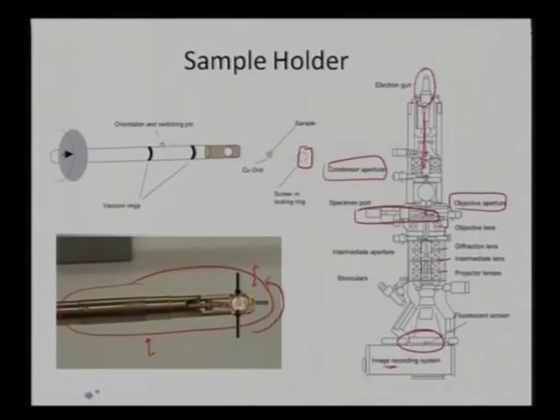But preparing a sample to attain transparency to electrons is very, very critical. Since my samples will mostly be bulk in nature, even selecting a particular piece of sample from a bulk is very, very challenging, because first of all my sample has to be representative of the overall bulk structure I really intend to look at. For example, say I am extruding a rod. The structure at the surface will undergo much more shear, so grain refinement might occur much more at the surface, whereas the grains may remain unaltered at the core. So if I take my sample only from the surface and say it is representative of what is happening in the core of that rod, I am totally wrong. I need to carefully select my sample and relate it to the particular surface or area where I took it from. So I might require samples from both the surface and the core to say what is happening at the surface and what is happening inside the core of that rod.